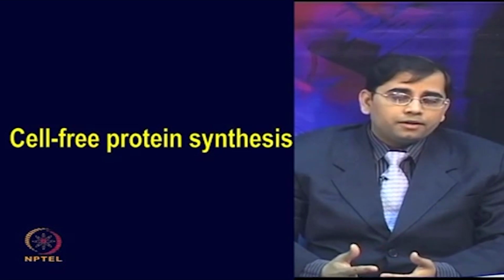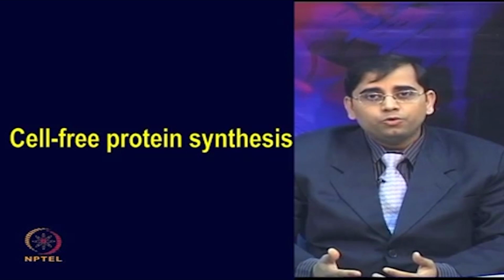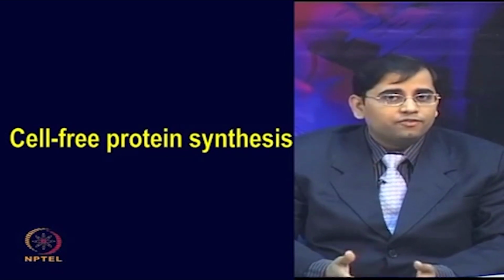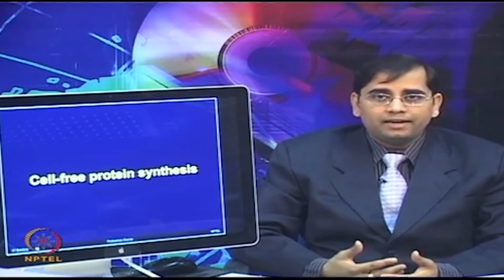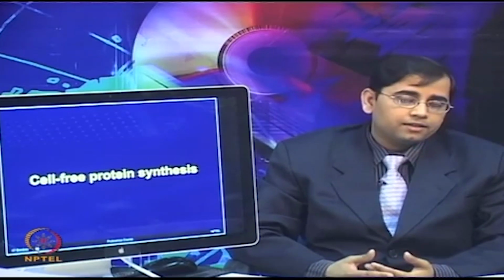These clones are important and required regardless of whether you want to make the protein by a cell-based or cell-free method. But since microarrays require a high throughput manner, it is very difficult to purify thousands and thousands of proteins, especially when you want to preserve their activity for functional assays and functional activity testing.